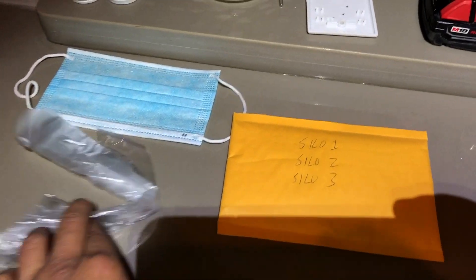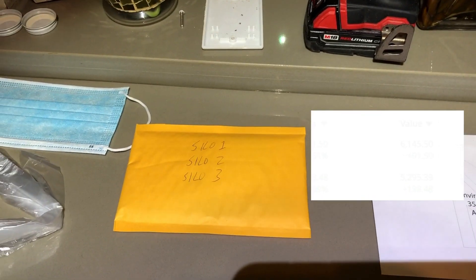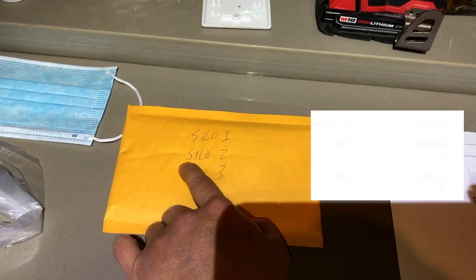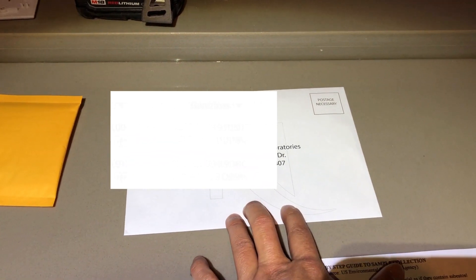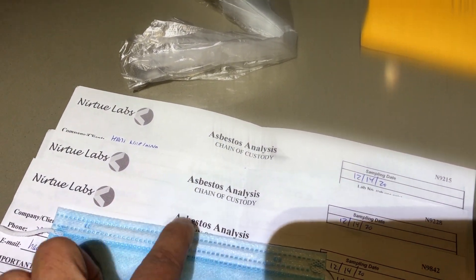Going through the kit contents: they provide a pair of gloves, a mask, and a padded envelope. I've already placed my three samples inside — each sample is in its own Ziploc bag, labeled with a permanent marker. I also noted the sample ID for each one on the chain of custody form. It also comes with a return envelope.